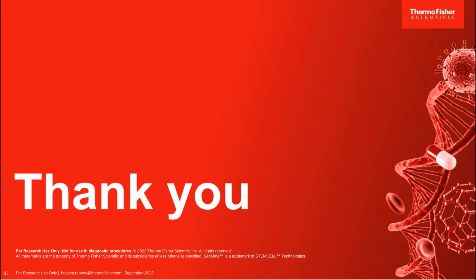Okay, great, thank you. Looks like we have time for one more question. Why are some of the images a lighter background and others have a darker background? So, for example, on the slide with the Dynabeads, the bead images have a light background.